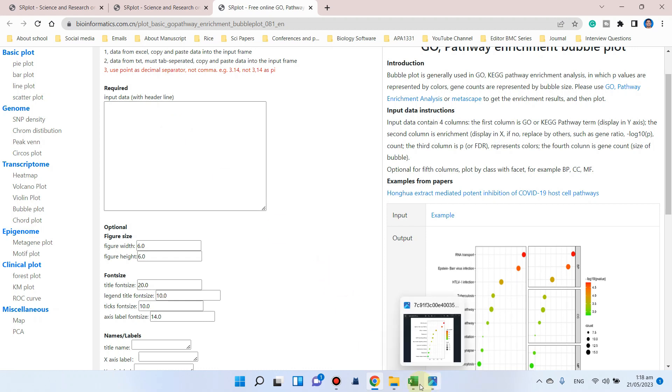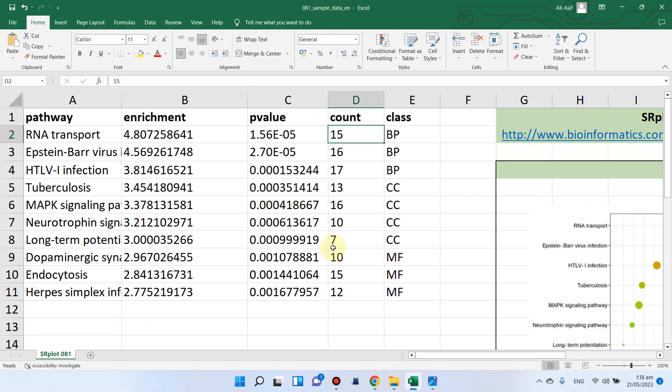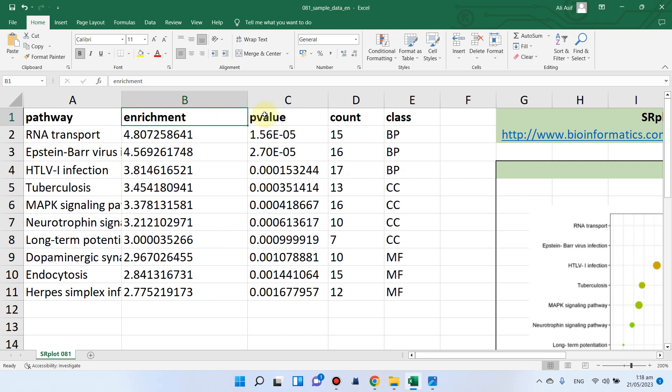Here I have one example file which I prepared. You can see we have different pathway names, enrichment factor, p-value, and number of genes. In this example, they have already mentioned enrichment score.